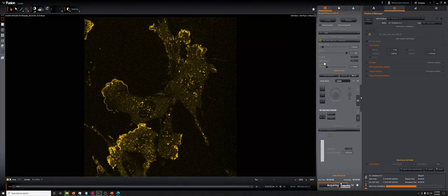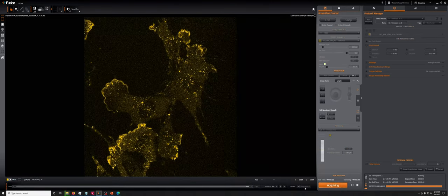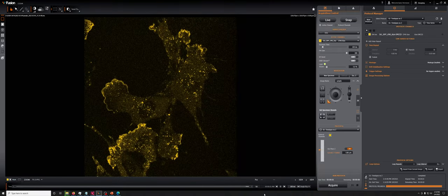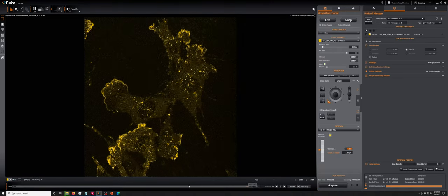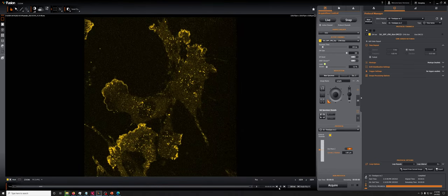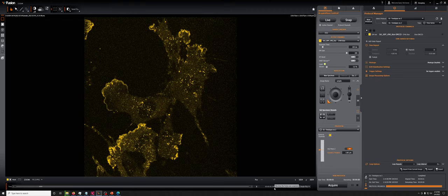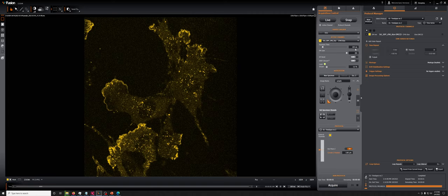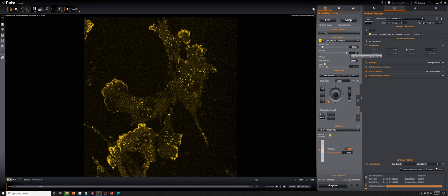If we acquire things under these conditions, you can see that actually the spacing between each frame is 144 milliseconds, which tells us that in addition to these 100 milliseconds, there were 44 other milliseconds when something else was happening. And that something else was moving data off the camera.